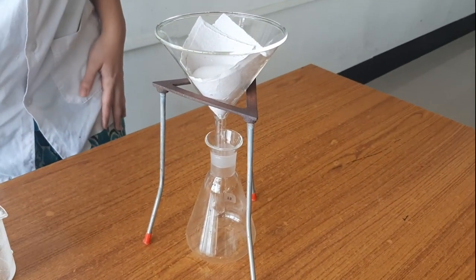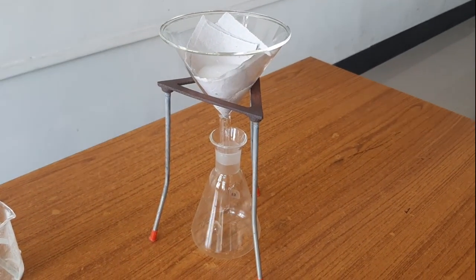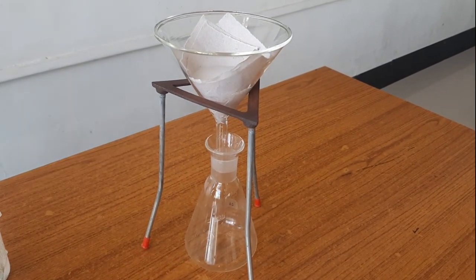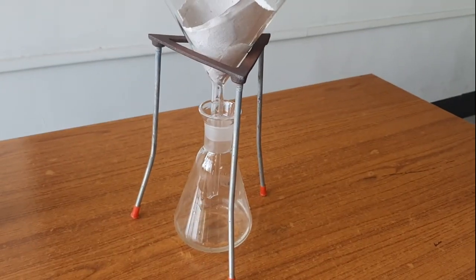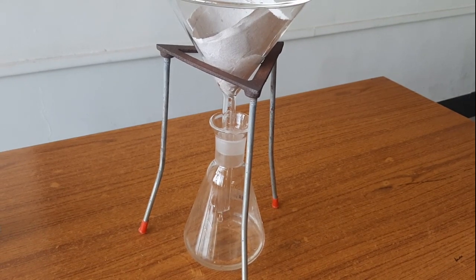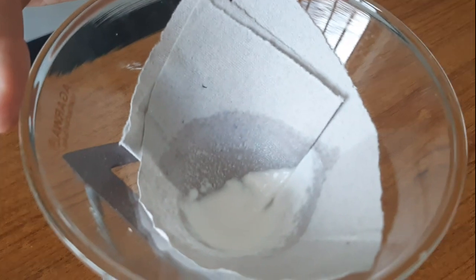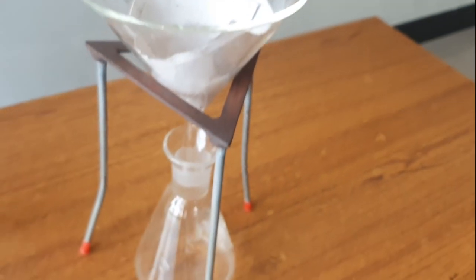We have started the time, and we will calculate what time is required for completion. Now the filtration has occurred completely, and we will wait till we get the last drop of the filtrate.